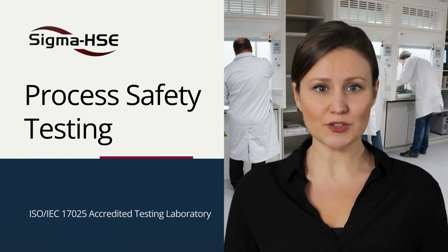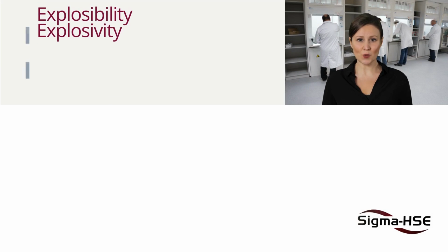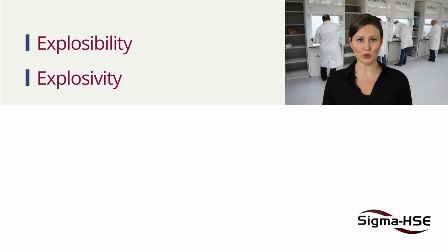Our laboratory measures flammable and explosible properties of your materials to aid in characterizing them with the goal of preventing and mitigating explosion and fire hazards. Our global laboratories test both explosible combustible dusts and explosive flammable vapors or gases to help you prevent an unwanted event. Our global laboratories will generate data on the explosibility and explosivity of your dusts, gases, vapors, and liquids.